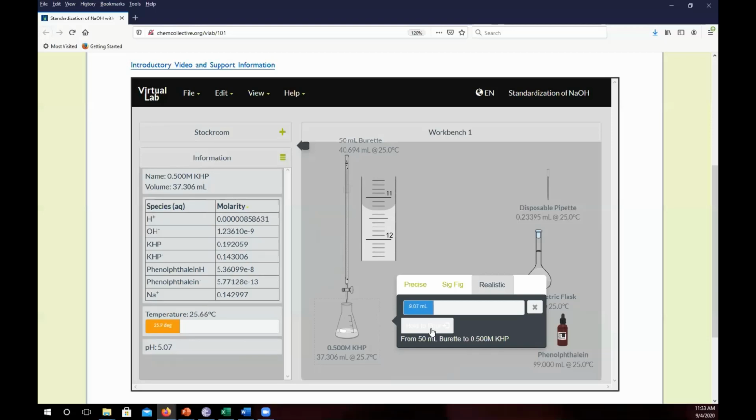Since you will know the approximate amount that should be needed, you can add quickly until a point and then start to add more slowly.